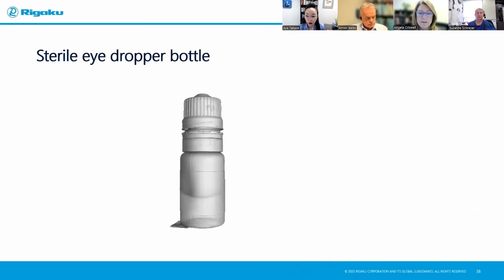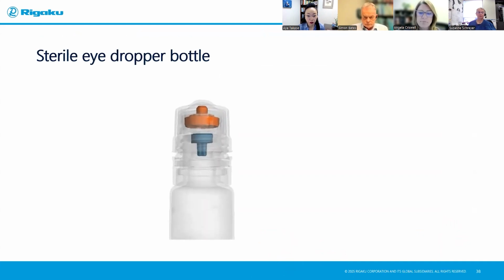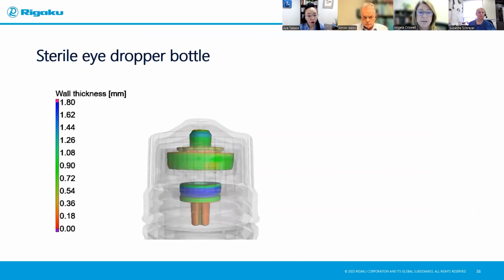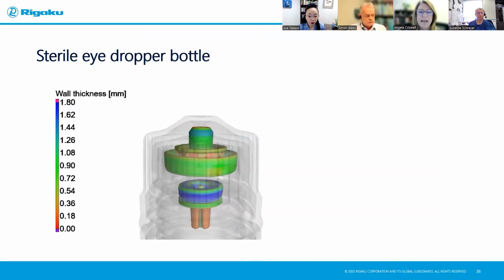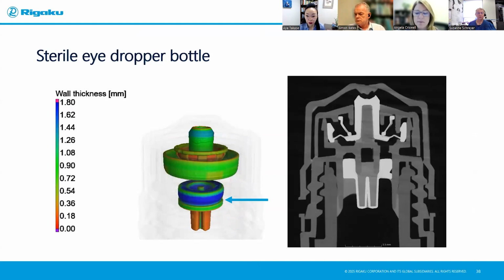The entire volume was segmented from those internal bright features, which were highlighted in orange on the top and blue on the bottom, and we can calculate a wall thickness. What we notice is that there's a groove happening right here. There's a gap separation and some features going on at the top. If we open that, we can explain exactly how they're able to let the liquid out, but not let any airflow back in. Basically, that groove is right here.